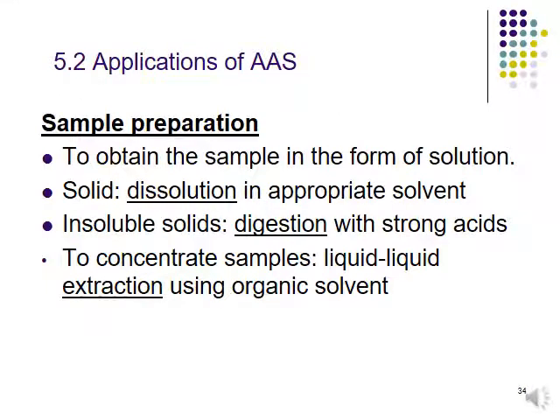Okay, so for the sample preparation, the aim is to obtain the sample in the form of solution. Sometimes there are samples that come to you in solid form. So you need to dissolve your solid sample first to become liquid form, because AAS will only work if your sample is in liquid form, in the form of solution.